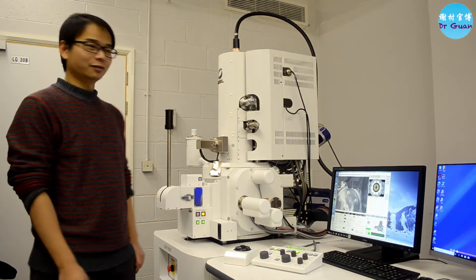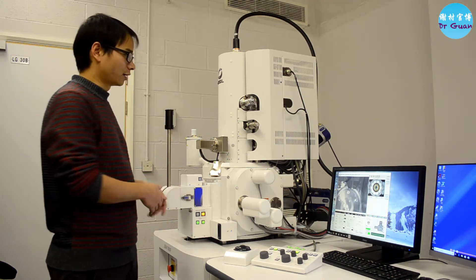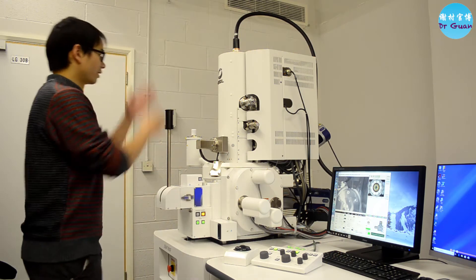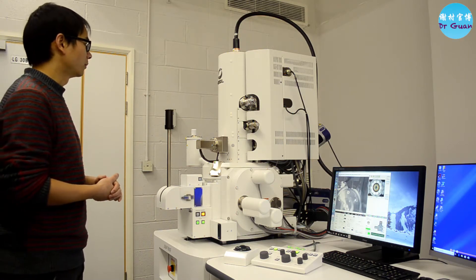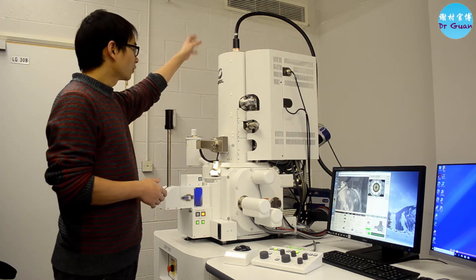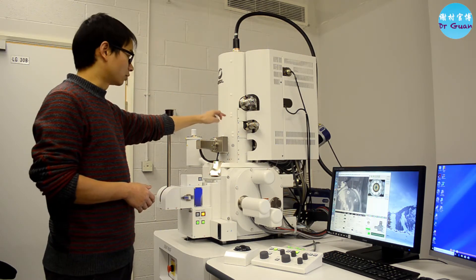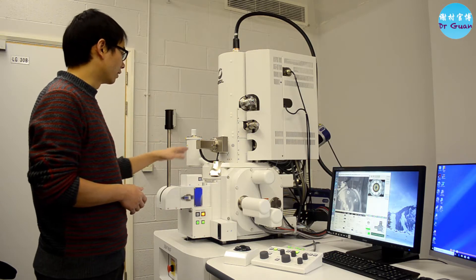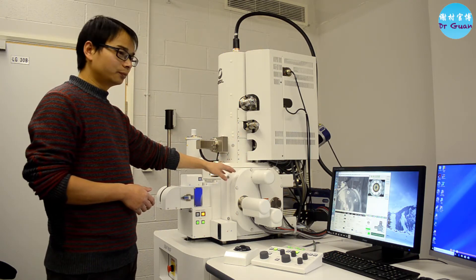Good morning everyone. My name is D-Kai Kuan. I'm the administrator of this SEM equipment, which also includes the EDX detector and the EBSD detector. This is the JEOL 7900F field-emission SEM microscope, which is quite different from the FEI systems we have previously used. That is the electron column, the condenser aperture, the objective aperture, and a series of electromagnetic lenses. Here is the stage motor.